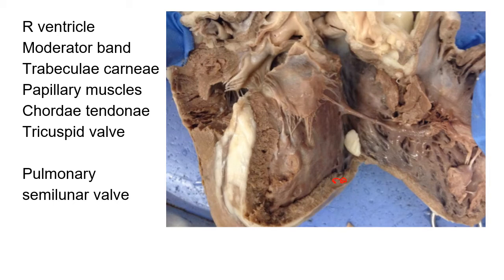First, look at the thickness of the right ventricular myocardium. And recall from our conversations that the right ventricular myocardium is not very thick. It's thicker than an atrium, but it's not nearly as thick as the left ventricle. So that's how I know this is the right ventricle, the thickness of the myocardium. It's a little bit thick, but not like the left side.